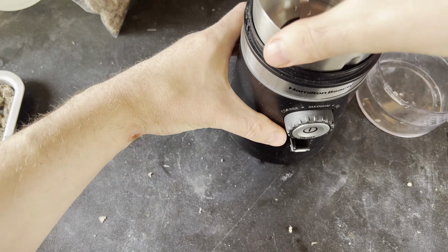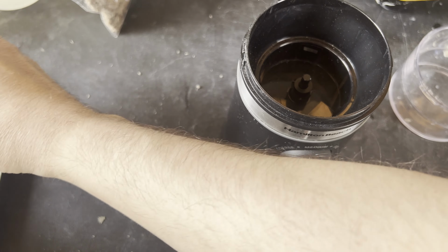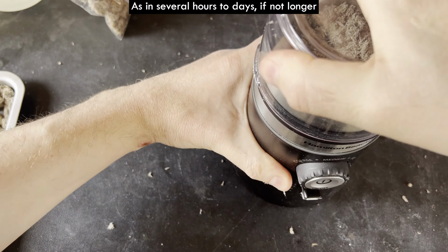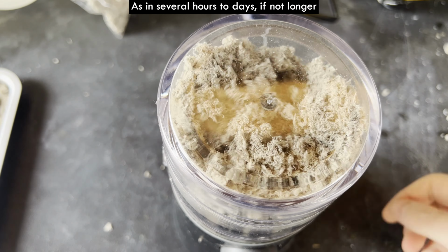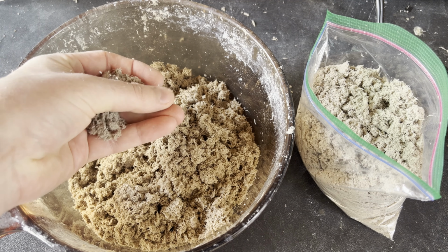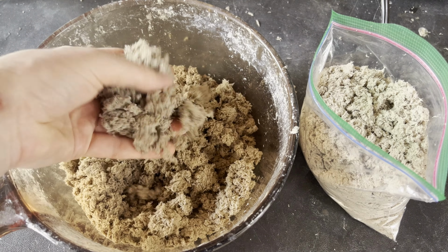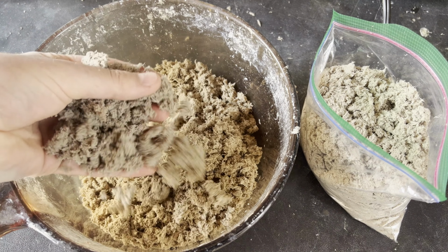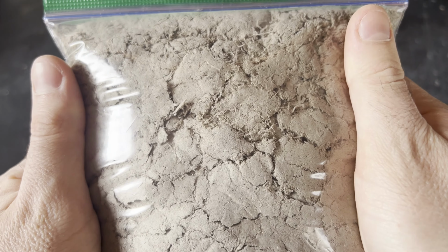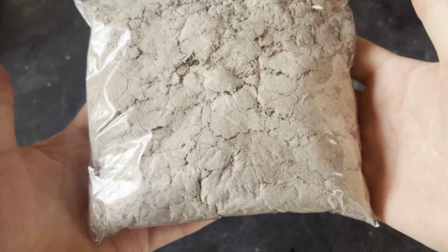Strong bases do technically react with it, eventually dissolving it if they're concentrated and hot enough, or if they're cool and are in contact with it for an extended period of time, so they can't be used to purify it. It can be used to filter pretty much everything other than hydrofluoric acid, and that does include concentrated alkalis if they're not hot, because they don't reside in the filter long enough to react with the asbestos.